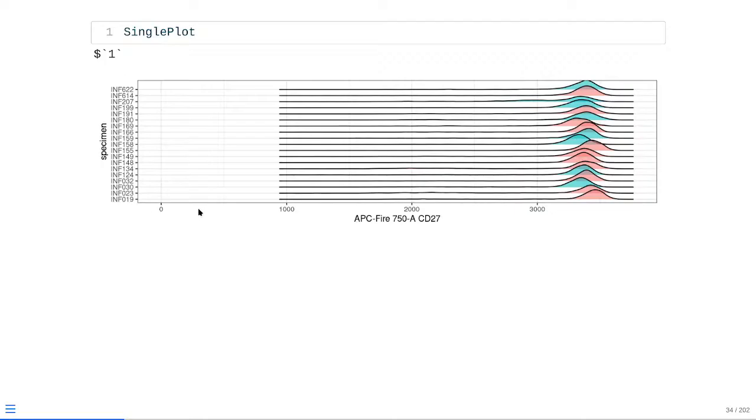Of course, this is still a one-dimensional view. The other consideration to have for ridge plots is if you have a lot of negative cells and just a few positive cells, the positive cells are going to get drowned out, really scrunched down next to the x-axis. But it's a different way of being able to view your same data set as well.